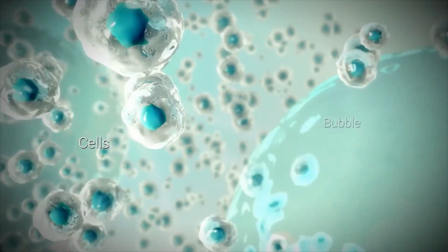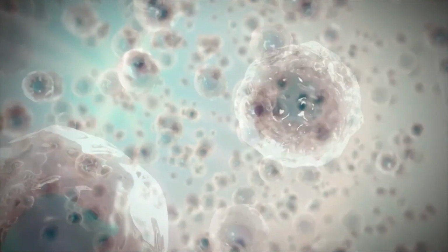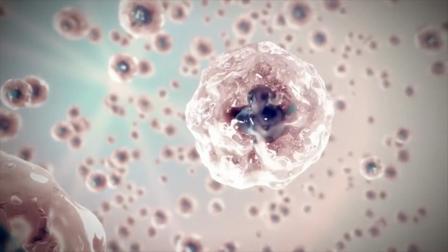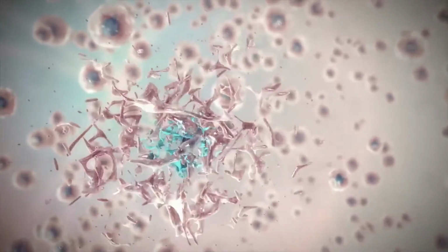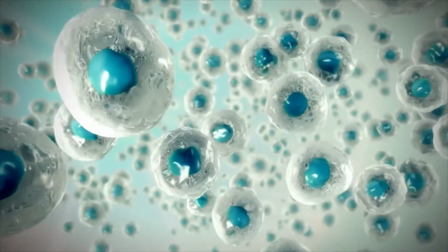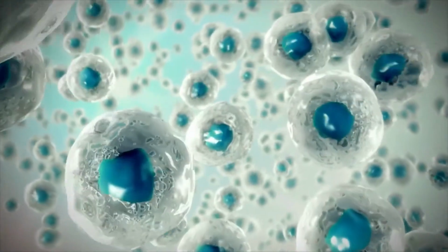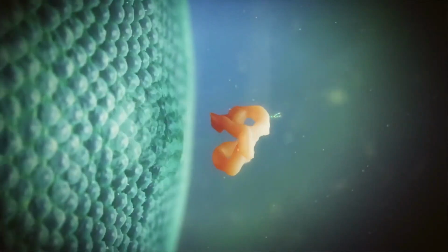Variables, including temperature, pH, nutrients, and oxygen levels, are continually monitored and optimized within the bioreactor. In suboptimal conditions, for example, when temperature is too high, the cells will produce less protein or start to die. Controlling this environment helps to ensure proper cell growth, metabolism, and various protein modifications required for proper protein folding and function, and therefore helping to ensure high-quality product.